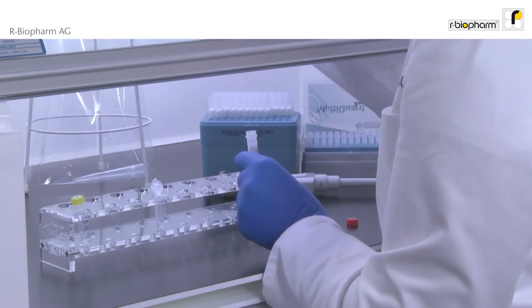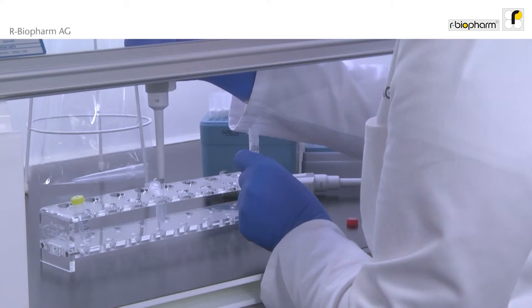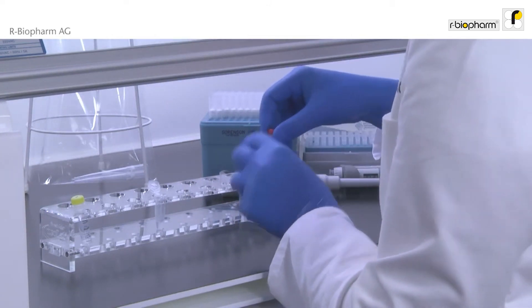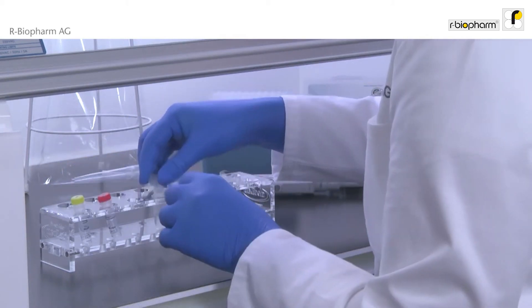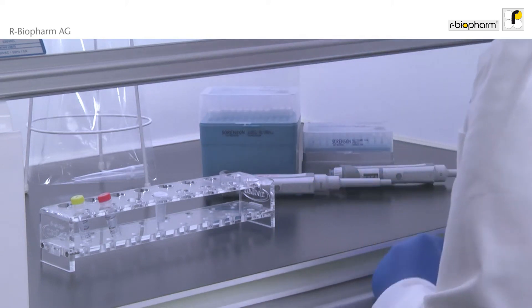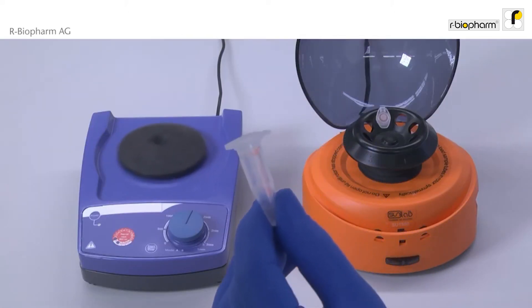Mix shortly. Now the master mix is prepared. Centrifuge the master mix.